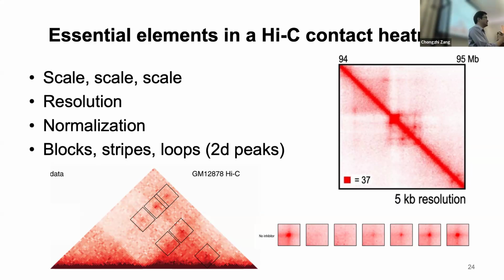if you believe that these cells are homogeneous, from the same cell type, then you can understand that this so-called loop extrusion pattern can occur. But we are definitely not observing the dynamic process of this from a Hi-C experiment. So we will just interpret this in this way.